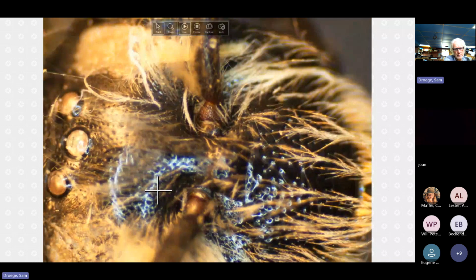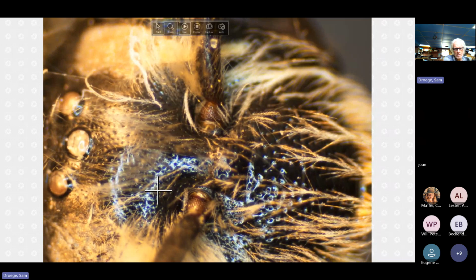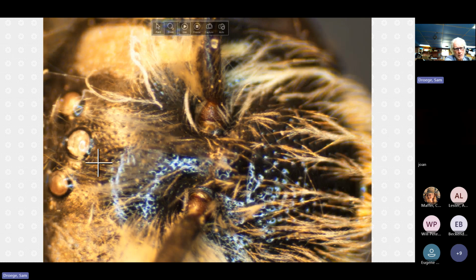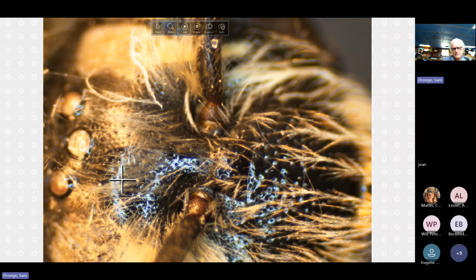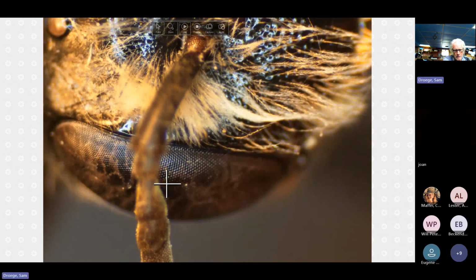I'll try and zoom all the way up that I can. And the pitting, so if you look up here, you can see that there's sections. It doesn't look like it's generic everywhere, but in a lot of these sections the pitting is about 1 apart. Maybe that's not the best character. And you can't really see this glossy nature of this area really well, so I apologize for that. It is, though, noticeable under the microscope.